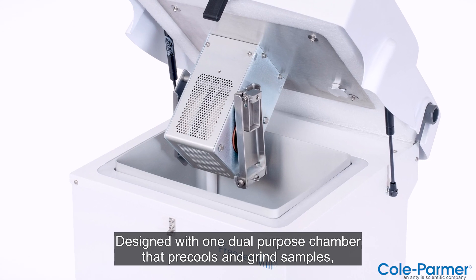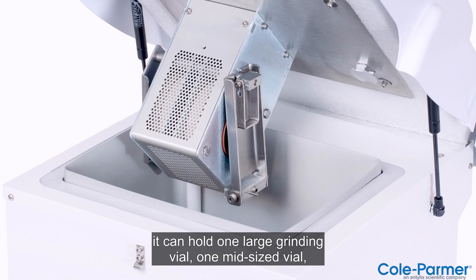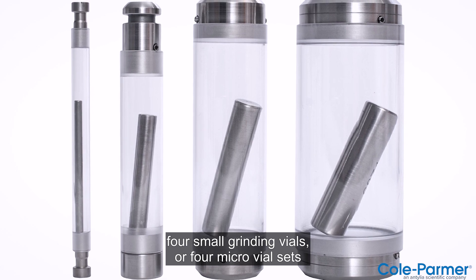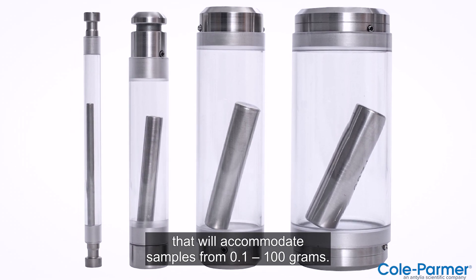Designed with one dual-purpose chamber that pre-cools and grinds samples, it can hold one large grinding vial, one mid-sized vial, four small grinding vials, or four micro vial sets that will accommodate samples from 0.1 to 100 grams.